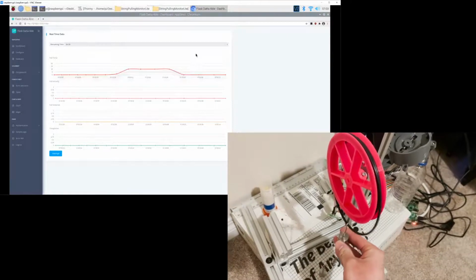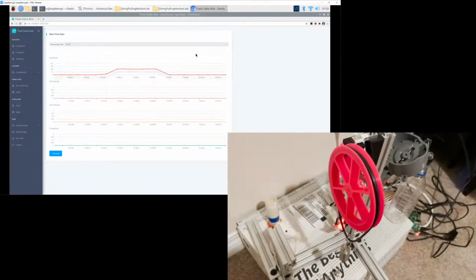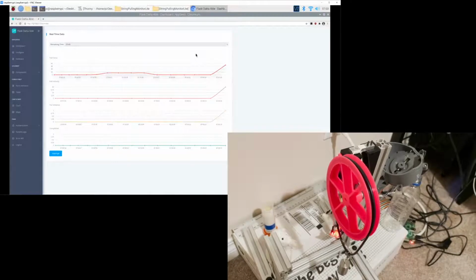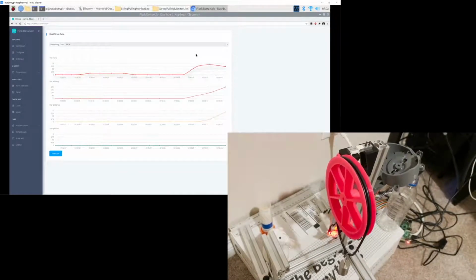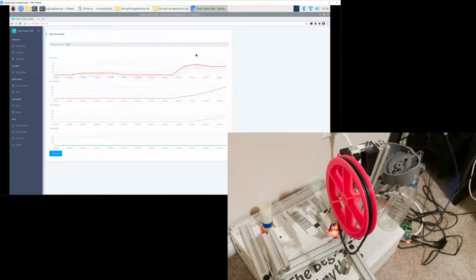Next, we are gonna change the load to 50 grams. It should be larger than the needed target force of the pulley, and the pulley will start rotating. When the pulley finishes its target turns, it will stop and the food dispenser will start to function and drop food rewards.